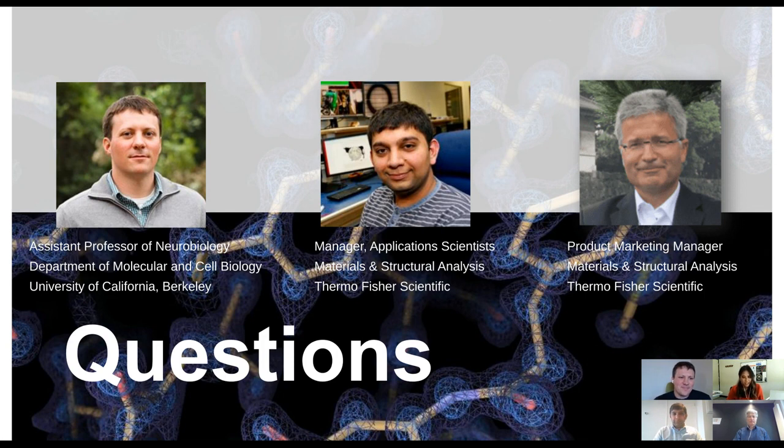Okay, thanks. So in terms of resolution, how much do you think the higher magnification on the Krios had on the final resolution of these maps? Abhay or Mark, would you like to answer? Yeah, I can at least say in our case, we don't know. We haven't done a comparison with the exact same pixel size on different microscopes.